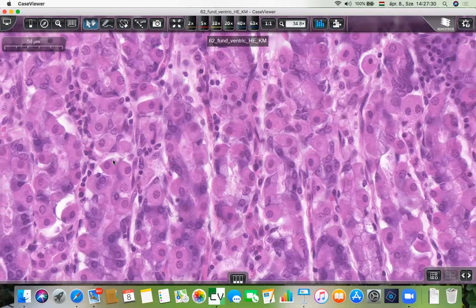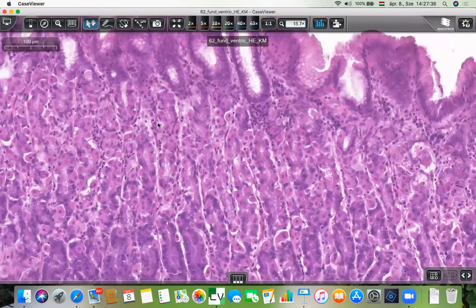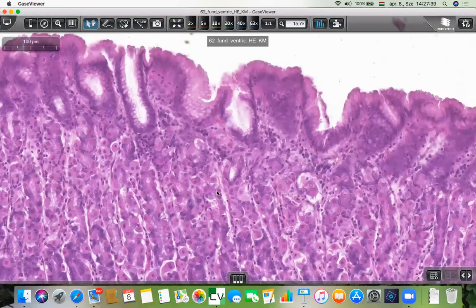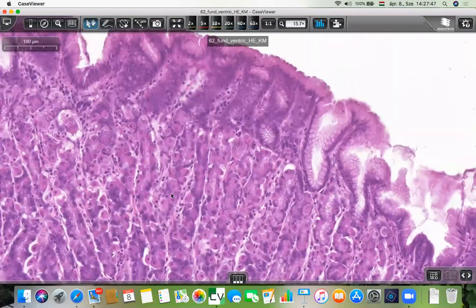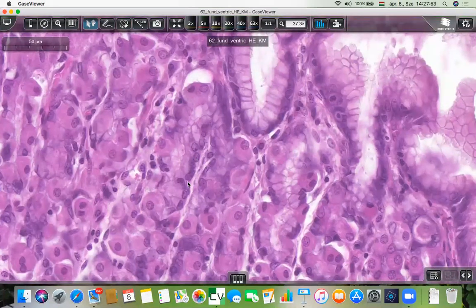The third type is a simple columnar, simple cuboidal cell close to the neck region, therefore called just mucus secreting neck cells. So these cells here, these are mucus secreting neck cells. At the neck region, obviously, they also secrete mucus just for the inner surface of the stomach.